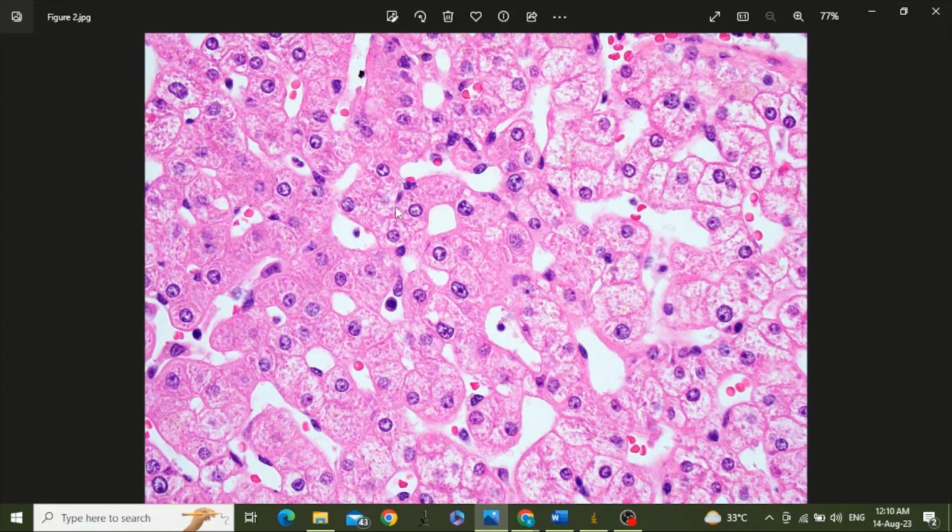Now closely observe this image. You can see there are many circular figures. Some of them are the nuclei of the hepatocytes, like this one, this one, this one, and many others. They appear circular, but there are many other circular profiles like these. They are probably blood cells. They are also circular, but their size is much smaller than the nucleus of a hepatocyte.